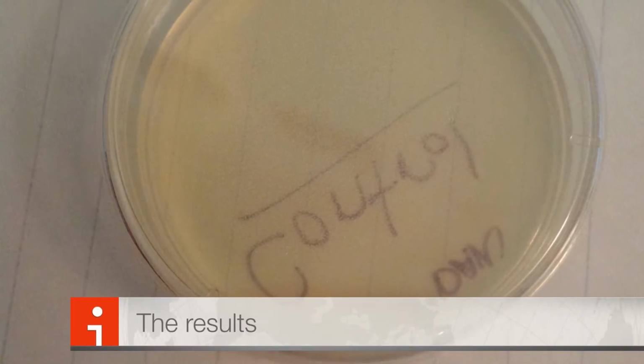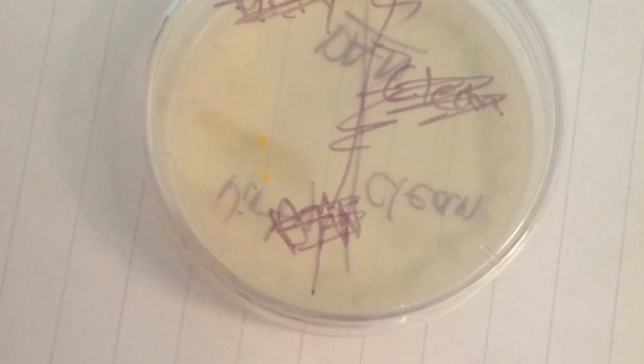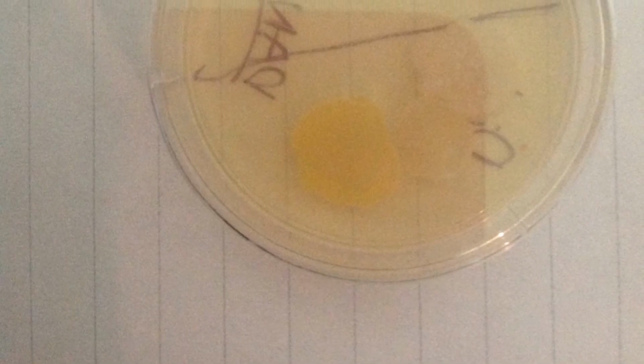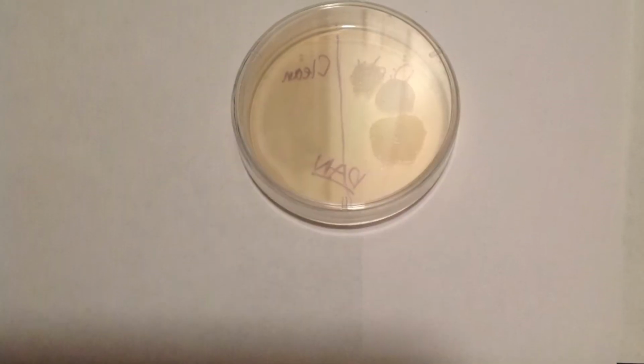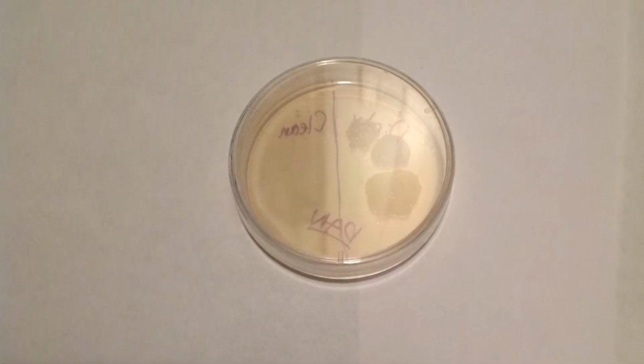After the petri dishes spent about 2 days in the incubator, I took them out and I wanted to see the results. So here I just took many pictures of the results, and as you see on the screen, you can see how many bacteria are in each petri dish on the dirty side and on the clean side. And mostly, I'm not talking about all the petri dishes, but mostly there were more bacteria on the dirty side than on the clean side. So that is a good thing for us that use Purell often.